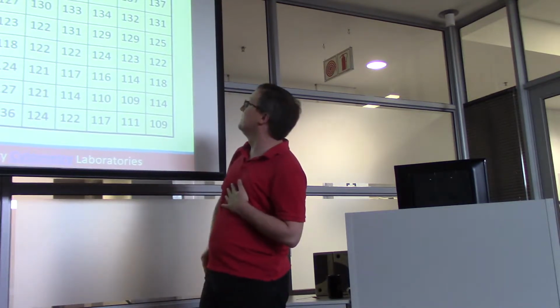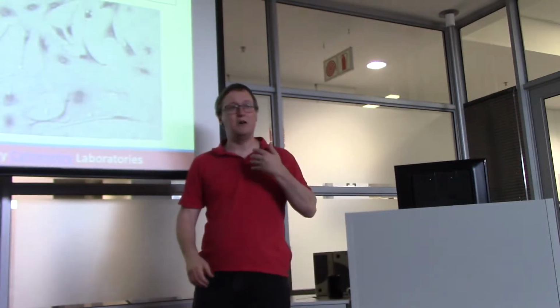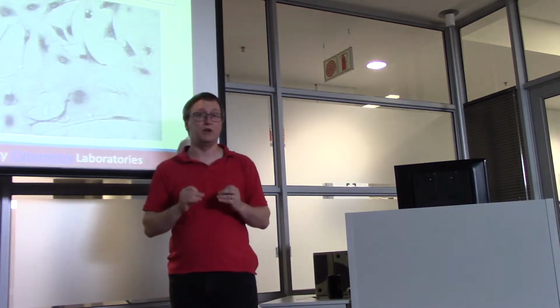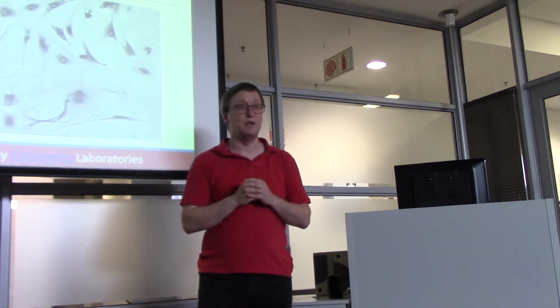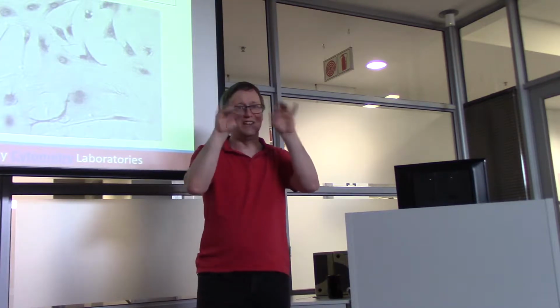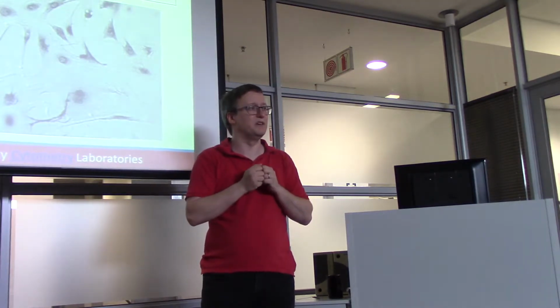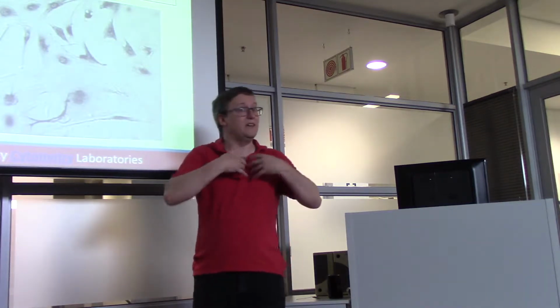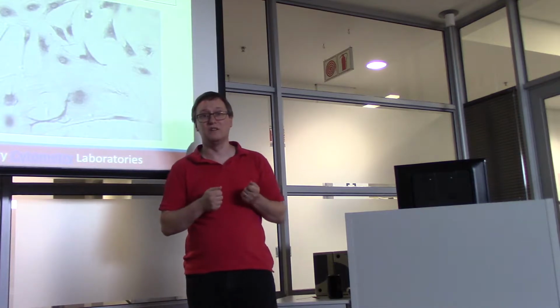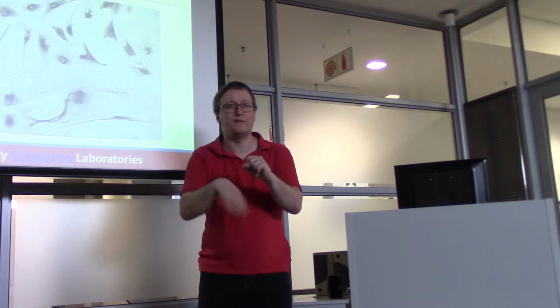All right. So I'm going to skip past this now. So those inputs and outputs can have a really dramatic effect. Gaussian filters are really, really good when you have a noisy image. Imagine if you had just this tiny little bit of snow in the picture, right? That's going to obscure the details that might be within it. And so in image processing, we would consider that high-frequency noise. It's just a speckle that appears in one pixel but doesn't affect the values around it.